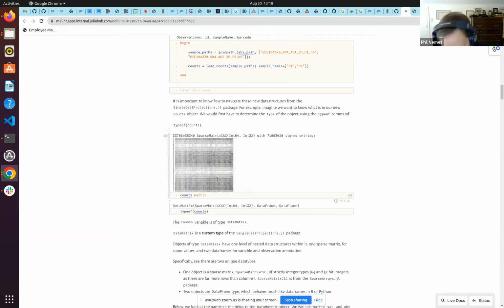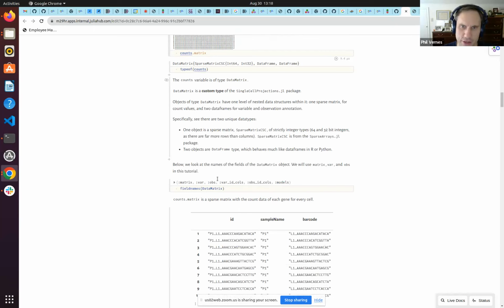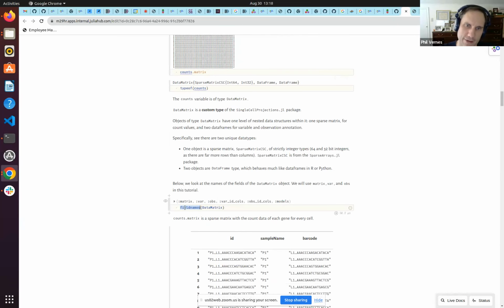We're really comparing to Seurat, and it's a lot faster. Okay. I think I've also illustrated, and this is just a handy bookkeeping thing, that when you have a data matrix of any kind, you can actually do a trick.